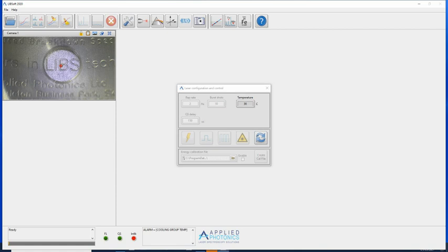When the required temperature has been reached, which for the Q-Smart laser is at approximately 36 degrees C, the interlock error is cleared automatically and the laser controls are enabled together with the acquisition initiation button. So the interlock has now been cleared. The laser parameter controls are enabled, as is the laser flash lamp control, and so is the acquisition initiation button in the main toolbar. The flash lamps can now be started in the normal way.